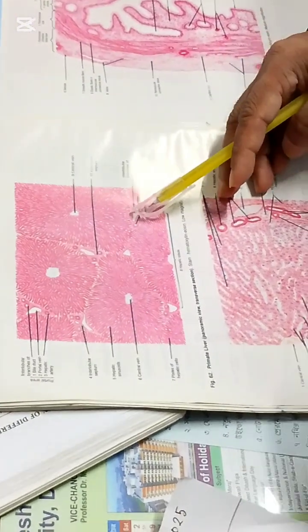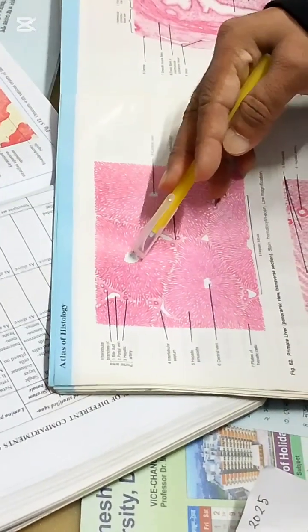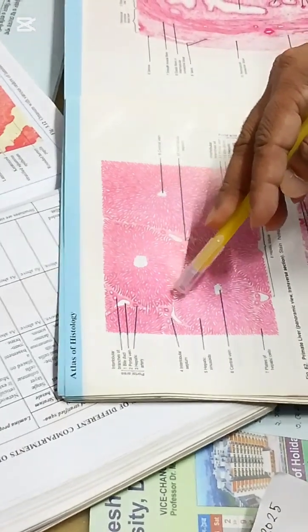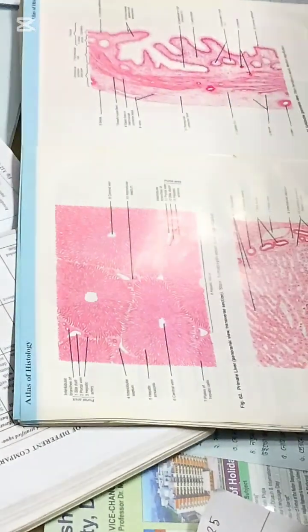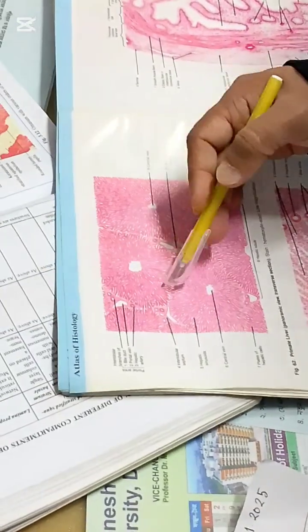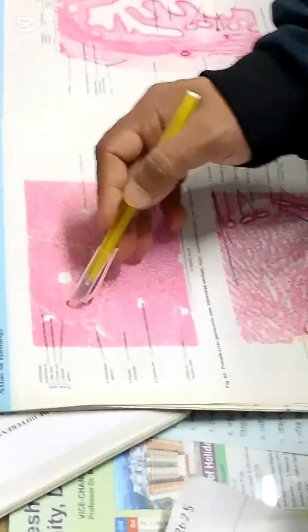And from the central vein, you can see various numbers of hepatic cells forming cellular rows. These are called hepatic cords, like rope cords. Lining of hepatocytes.